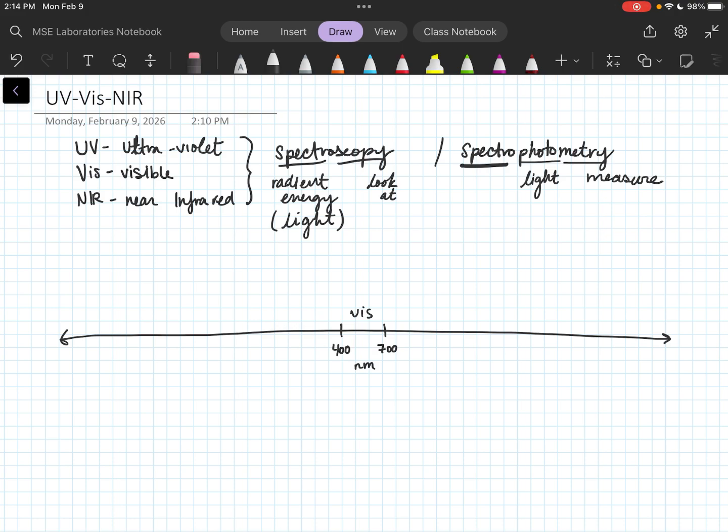So when we're measuring 400 to 700 nanometers, we are saying that light travels in a wave, and the distance from one peak to one peak is 400. Or maybe it's 401 or 402 or 403. But we're saying that our eyeballs can pick up waves as long as the wiggle of that wave is somewhere between 400 and 700 nanometers in size.